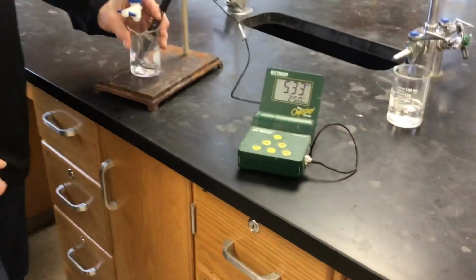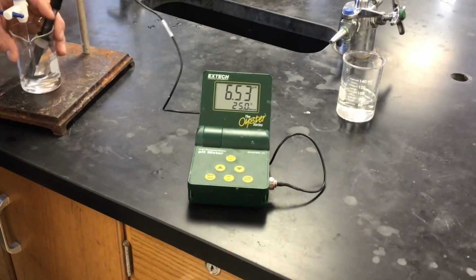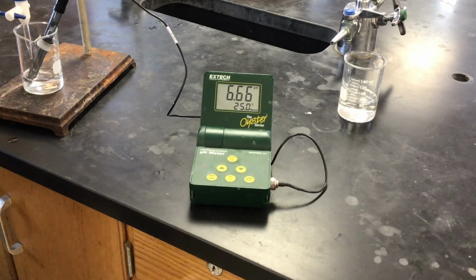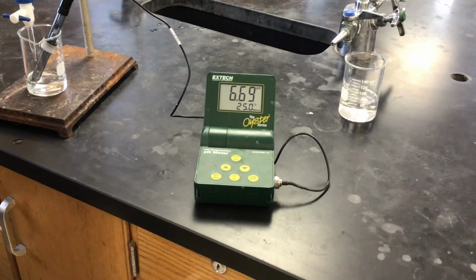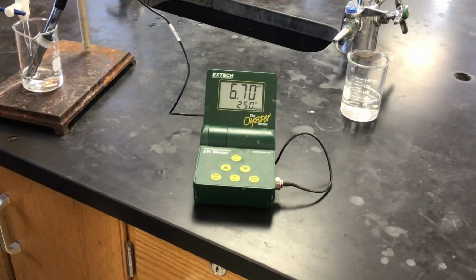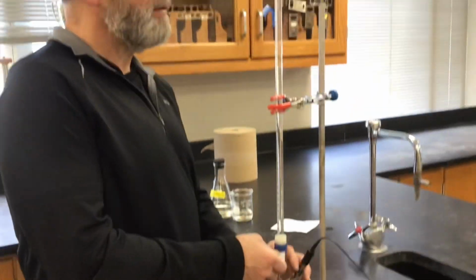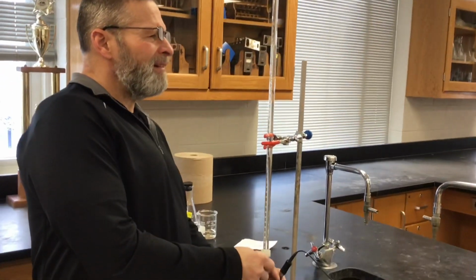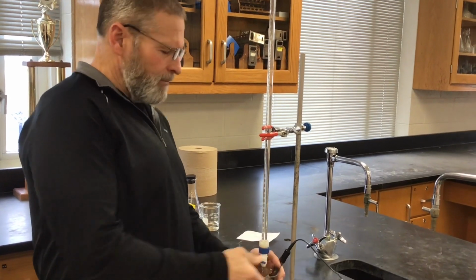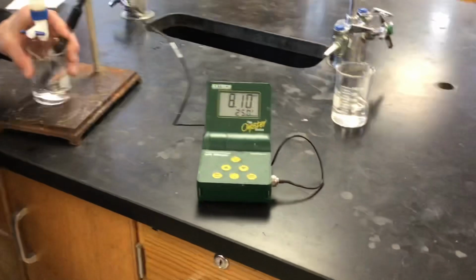11. Whoa. What's going on here? That was quite a jump. That was a huge jump. I'm only going to add 0.5 this time. Okay, so what is our current volume right now? We're at 11.0, and we'll go to 11.5 this time. There's 11.5. Now we're close to the equivalence point, so we'll start going a little bit slower.